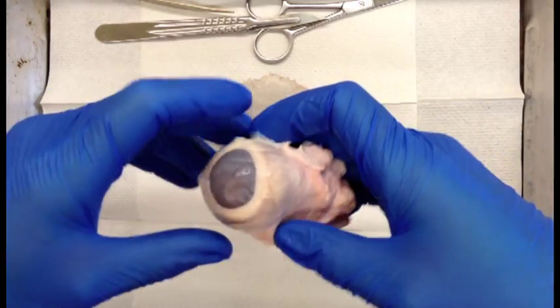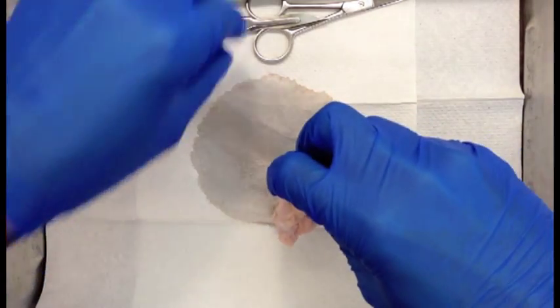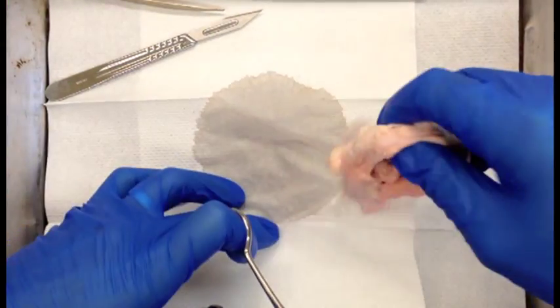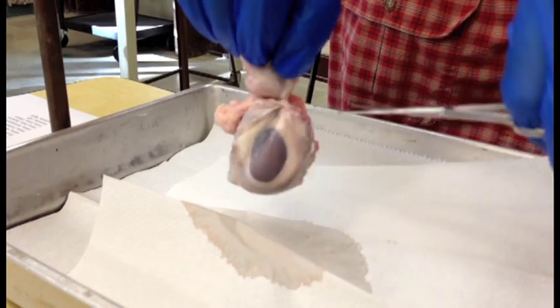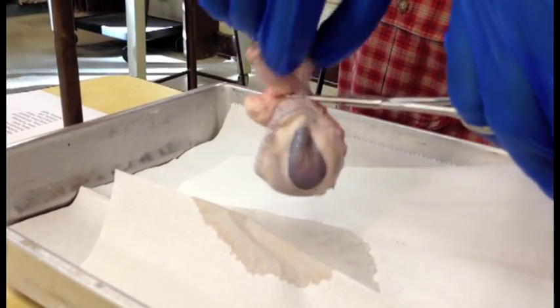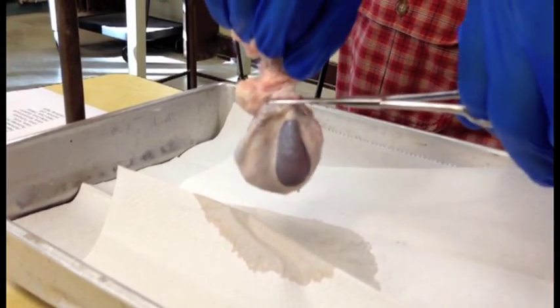Okay, so the next thing I want to do is to start to sort of clean this up. I want to get rid of a lot of this adipose tissue so we can get to the eye itself. So I'm going to go ahead and use my scissors and just go ahead and cut through. See, it's sort of rotating along as I cut the adipose tissue off.